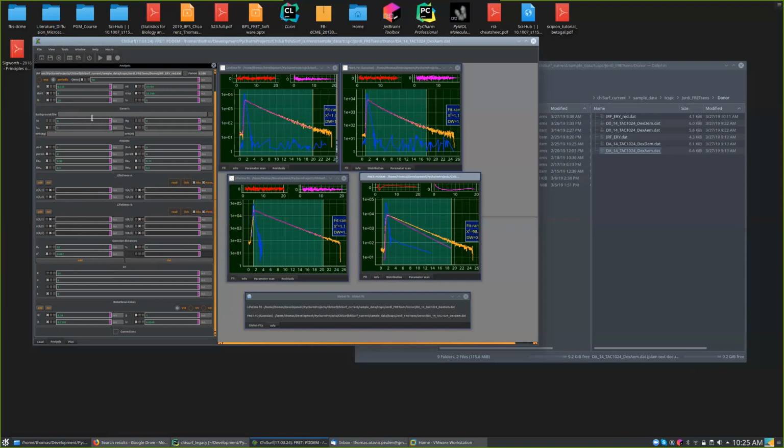Scatter, I don't know, usually you have very little scatter in the acceptor channel if you excite by the donor. The reason is because like you don't have the laser light leaking to the detector usually. So like maybe we can start here as a beginning with 0. And the background, I would also estimate here, maybe it's 5, maybe 10, I don't know.